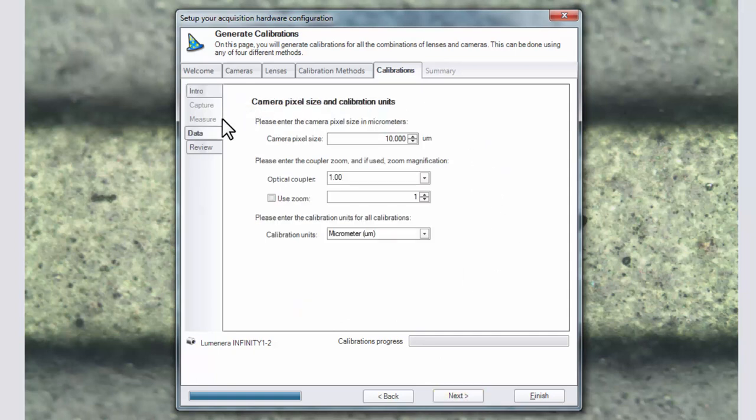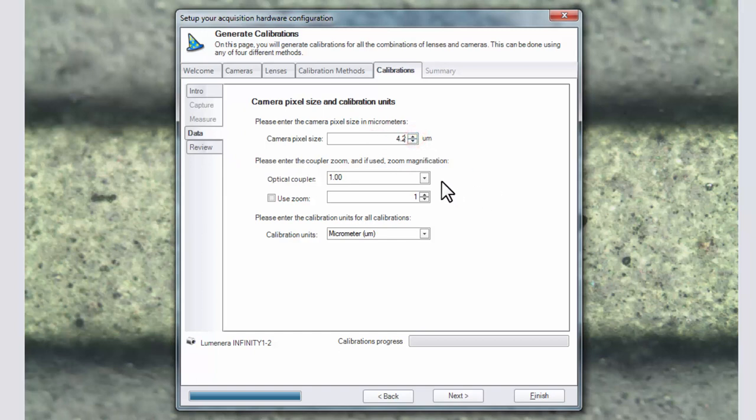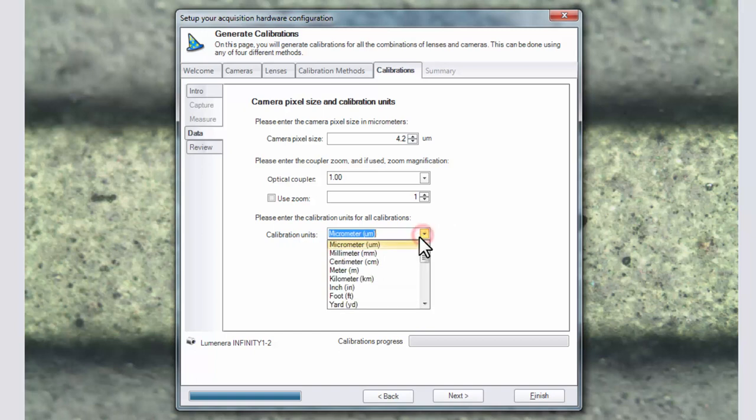At this stage we'll need to enter information about our camera. The camera pixel size which in our case is 4.2 microns. The optical coupler which is 1. Any zoom factors. And the calibration units that you'd like to use. And then click next.